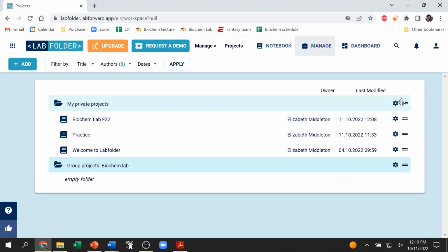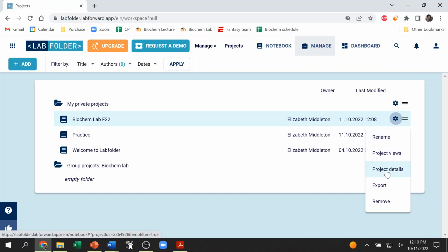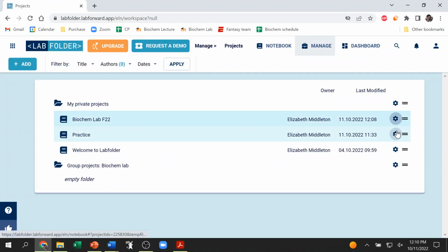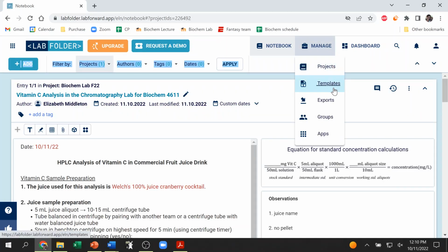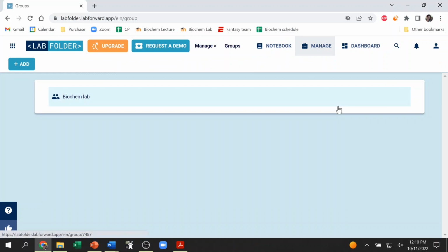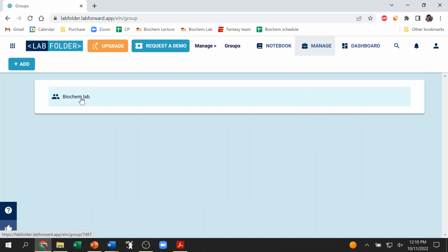Though that didn't work. Hold on. Maybe I need to do it this way. Nope. Whoops. Sorry, wrong click. Okay. Oh no, manage projects.